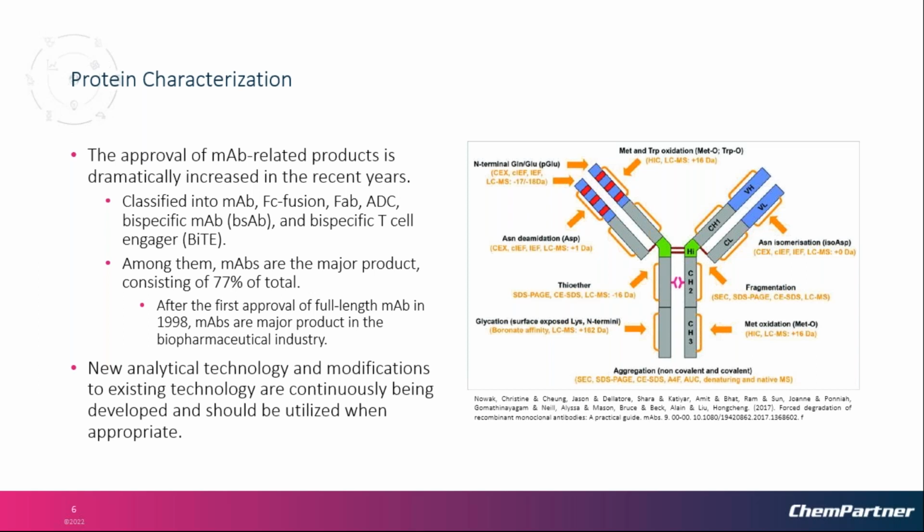For example, high pH conditions can promote disulfide-related degradation pathways, such as the formation of covalent aggregates due to disulfide bond scrambling. Incubation with reducing sugars results in glycation of many surface-exposed lysine residues.